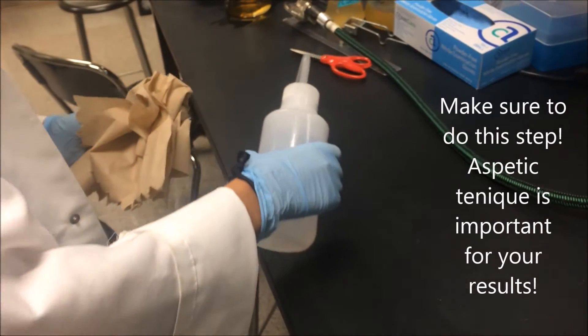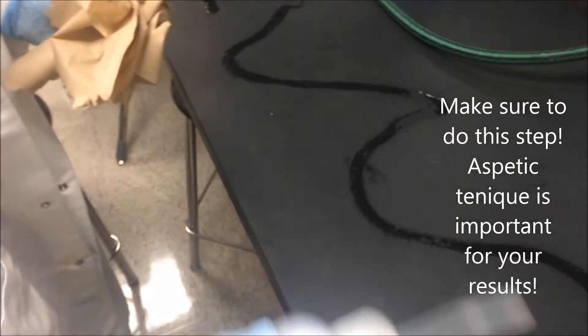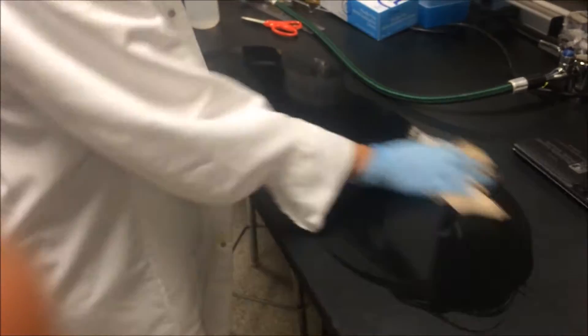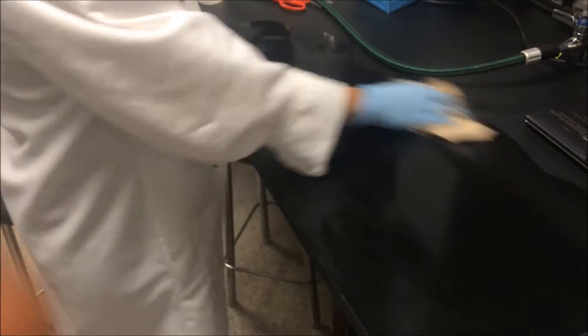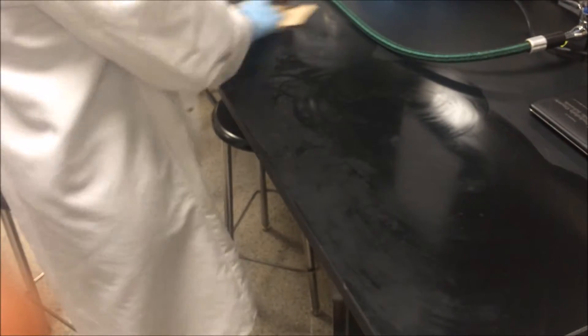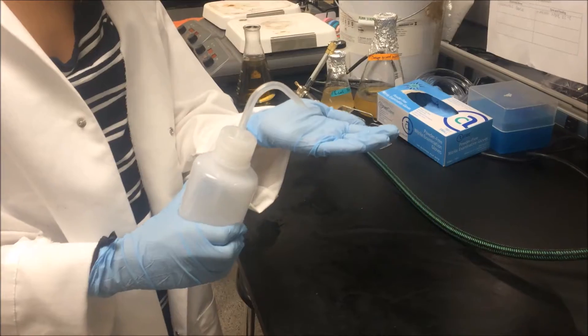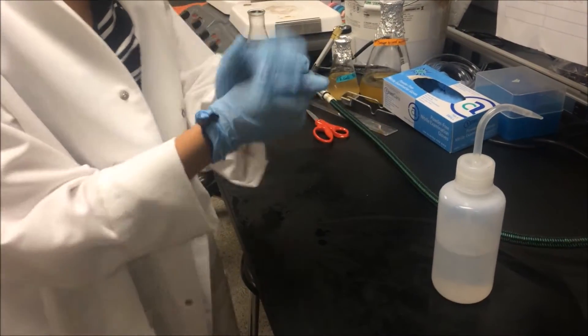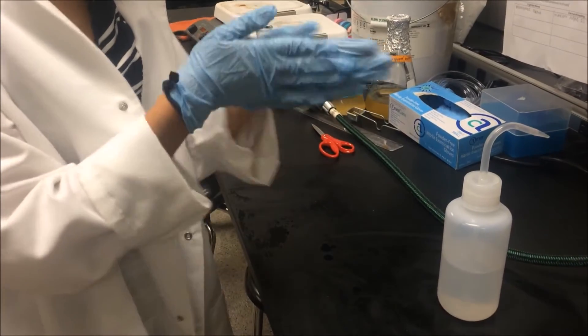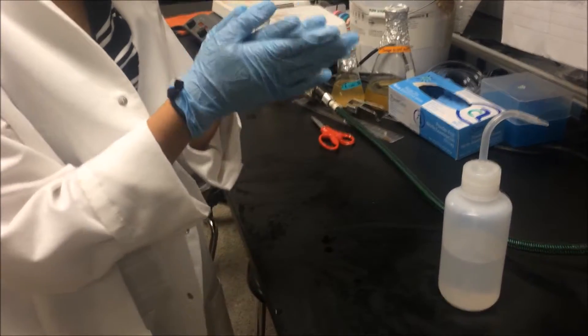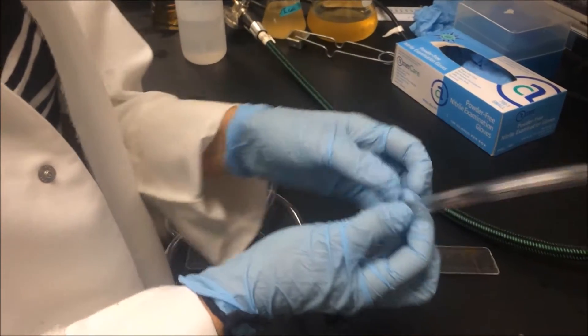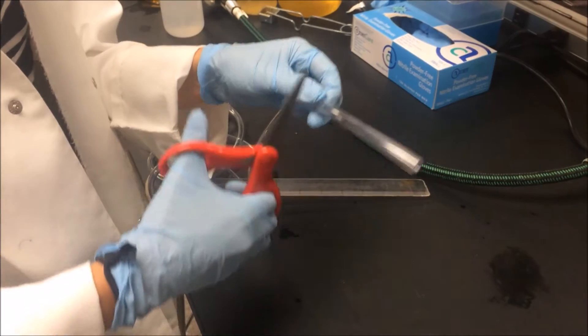Spray off bench with 70% ethanol. Put ethanol on hands. Measure 10 centimeters. Now cut.